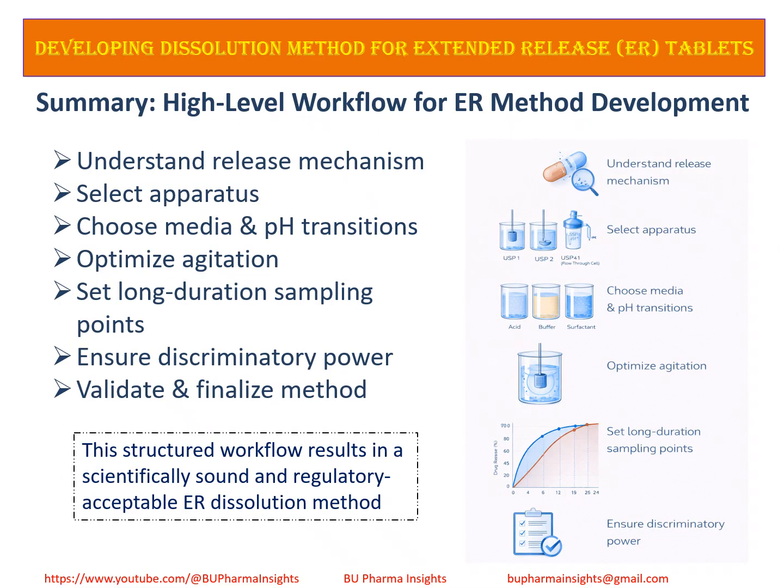To wrap up, an effective dissolution method must balance physiological relevance, robustness, and discriminatory ability. It all starts with understanding the release mechanism. From there, follow a structured, science-driven approach. Select the right apparatus, choose appropriate media and pH transitions. Optimize agitation speed, set long duration, meaningful sampling points, ensure the method can discriminate formulation and process changes, and finally validate the method.